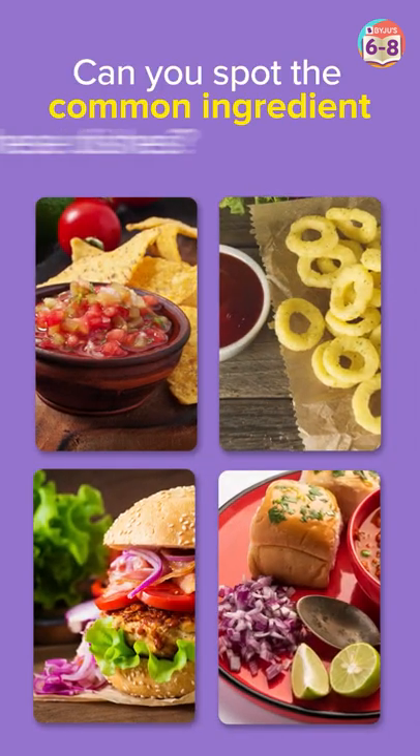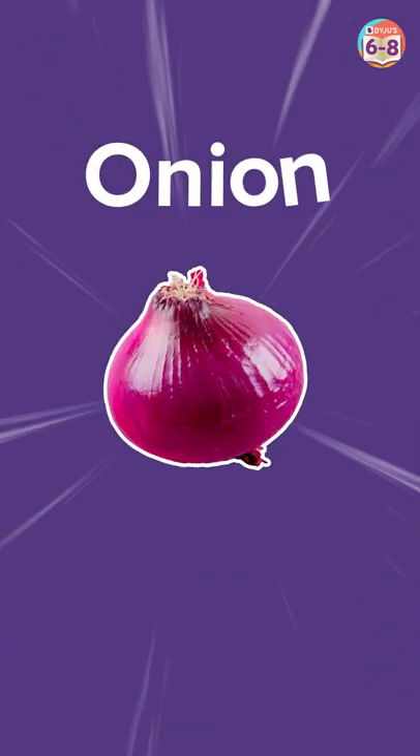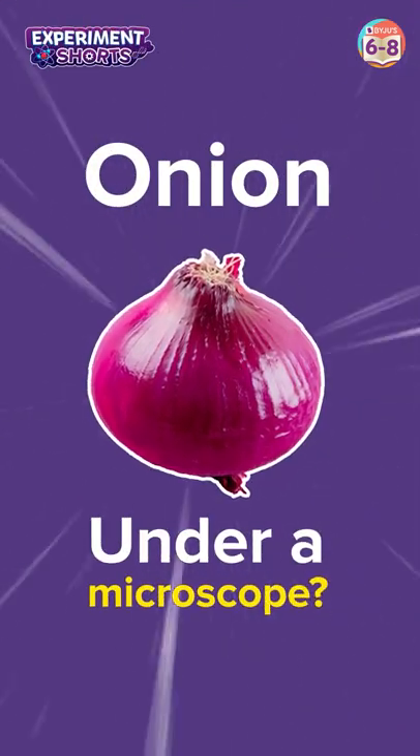Hey there! Can you spot the common ingredient in these yummy dishes? Yes! It's an onion! Ever wondered what an onion would look like under a microscope? Let's find out.